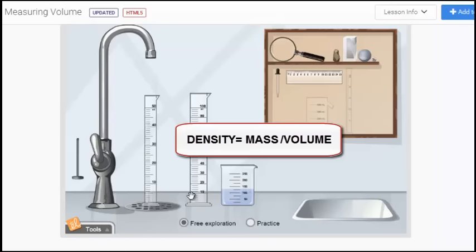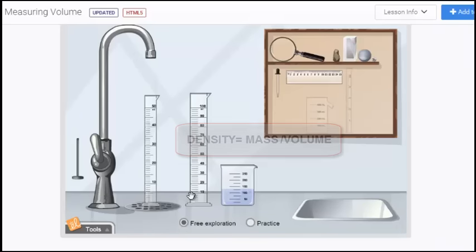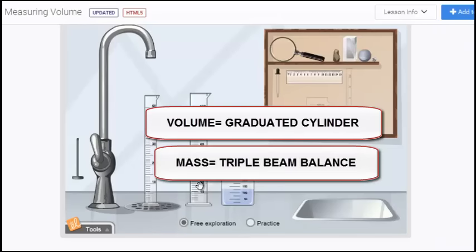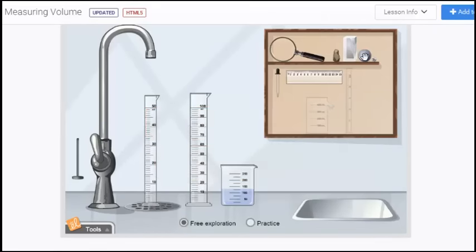So in order to find mass and volume we need tools and instruments. We're going to take a look at how to use two of them. To find volume we'll use a graduated cylinder, and to find mass we'll look at a triple beam balance. Let's talk about volume first. In order to find volume, if you remember, volume is how much space and room it takes up.